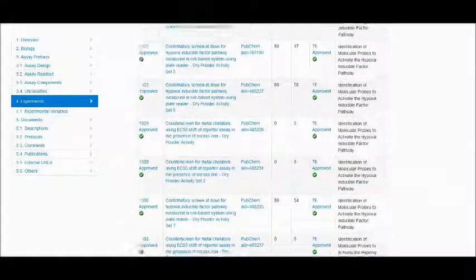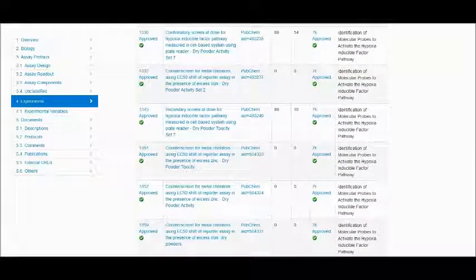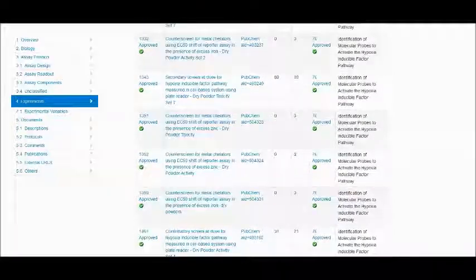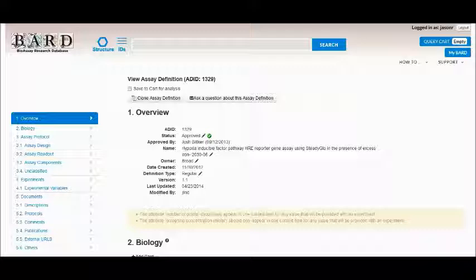And this way, not only can assay definitions be conserved across multiple experiments, they can even be conserved across multiple projects. This way, a center, for instance, if they were running 10 projects, and each of them were running a similar idea but had different targets, you could use the exact same assay definition for the primary screen for all 10 projects, and you'd have 10 experiments, 10 different projects under one assay definition. And it's a way of consolidating all of your data.